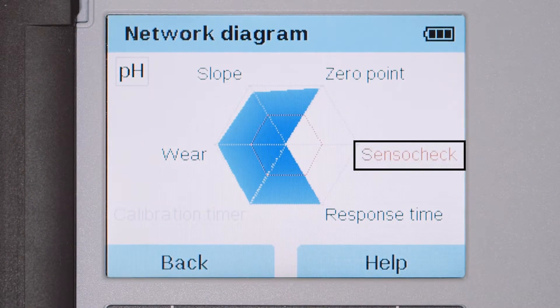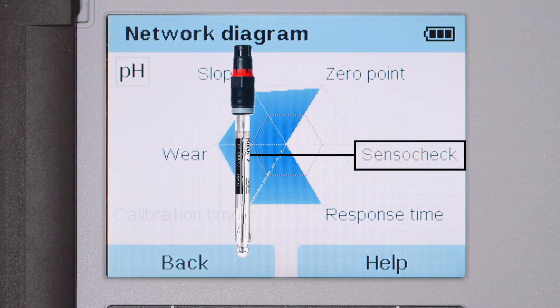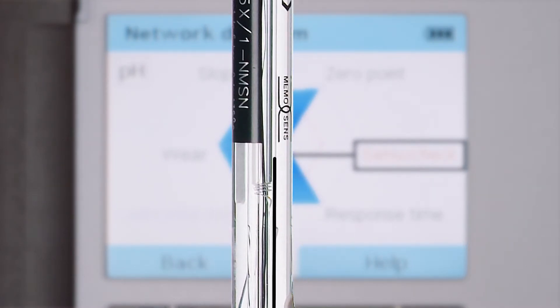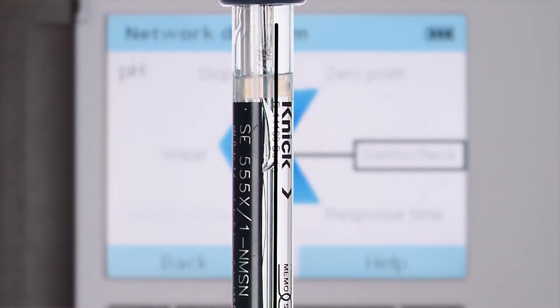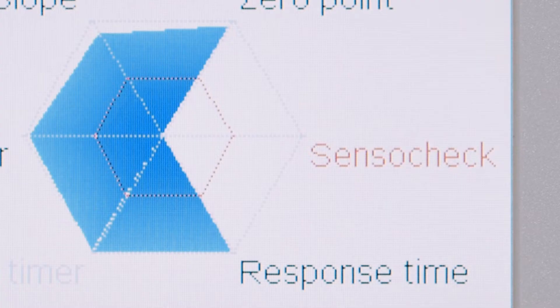The SensoCheck is a continuous monitoring function specific to the connected sensor. For instance, with pH and ORP sensors, the condition of the pH glass membrane and the reference electrode are continuously monitored. The wiring between the sensor and the meter is also monitored. A SensoCheck error may indicate that the sensor is broken or that you have a bad cable.